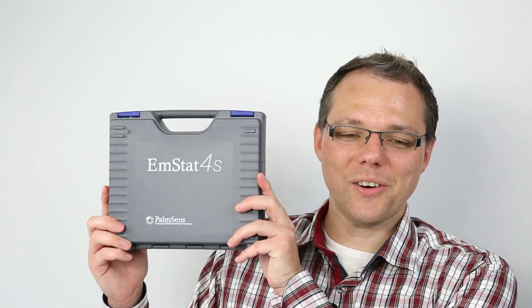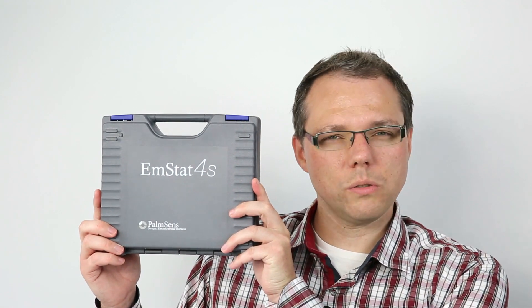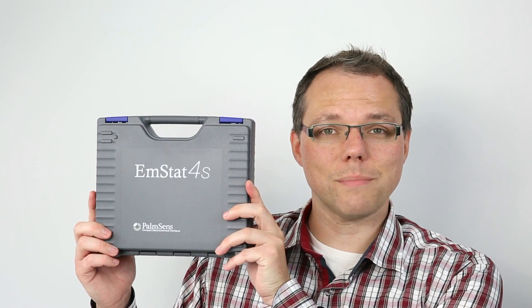Hello and welcome to this Palmsense unboxing video. I'm Lutz Stratmann and today we're going to look at the inside of the EmStat 4S box. We want to learn what you get together with your EmStat 4S, and we're going to perform our first measurement.